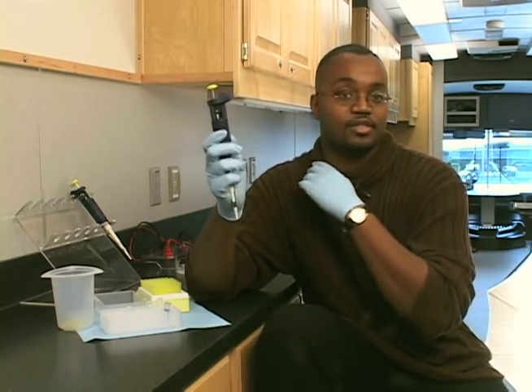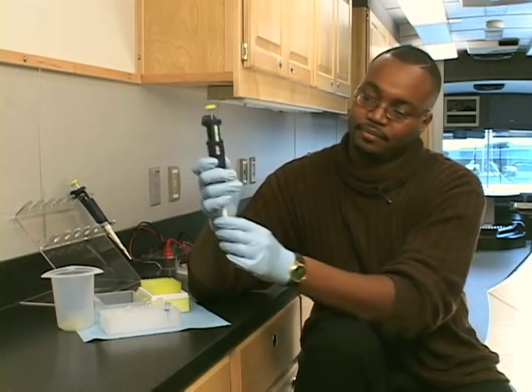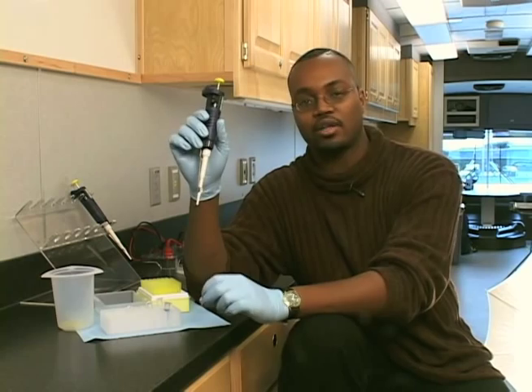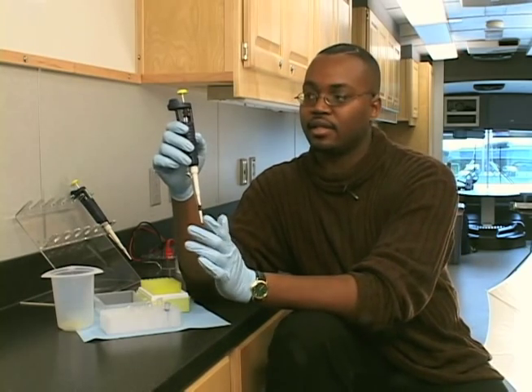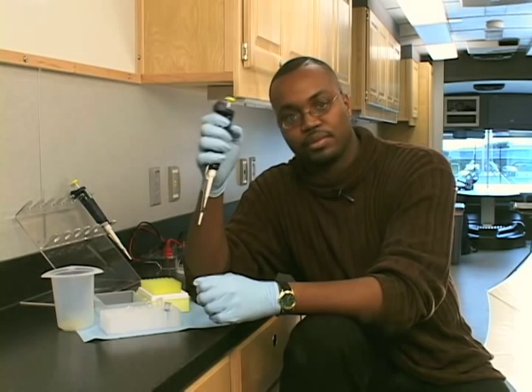Not only me, but scientists all over the world use this tool every day. What is the pipette? The pipette is a tool that's used to collect and release small volumes of liquids. In many laboratories, like mine, we work with proteins and DNA, and we need small volumes of liquids to mix them in, and the pipette is what we use to do that.